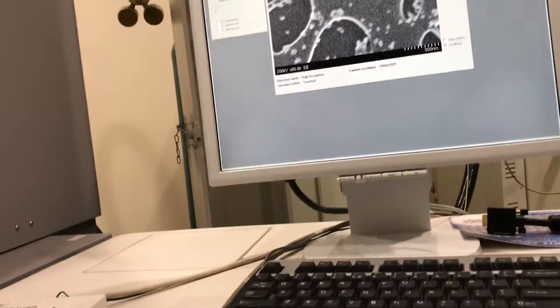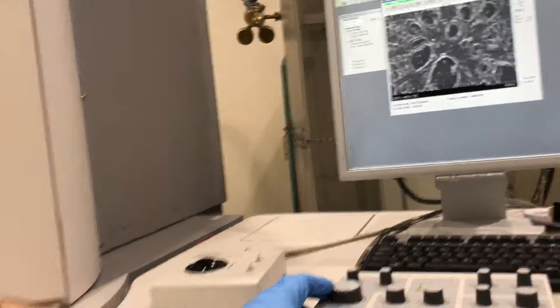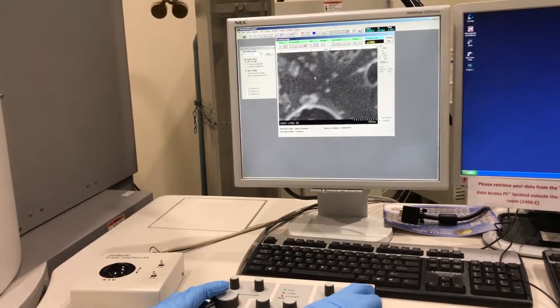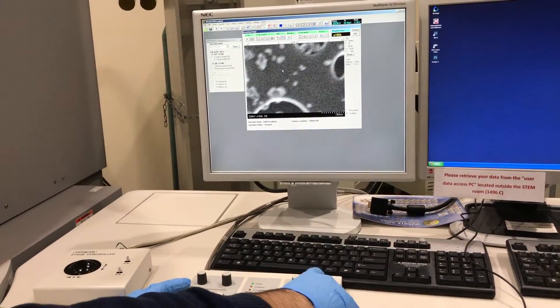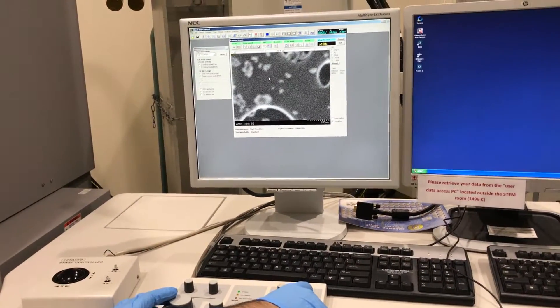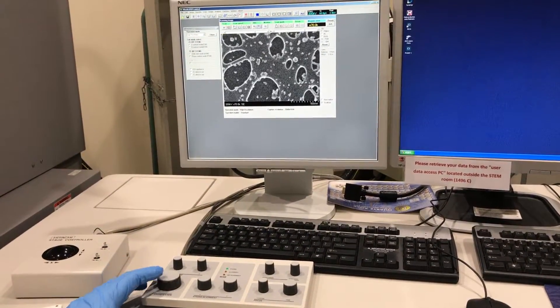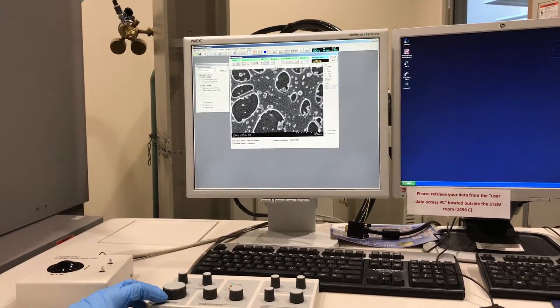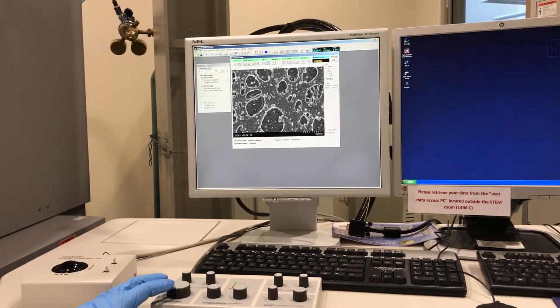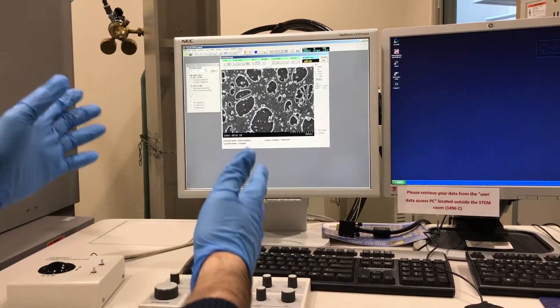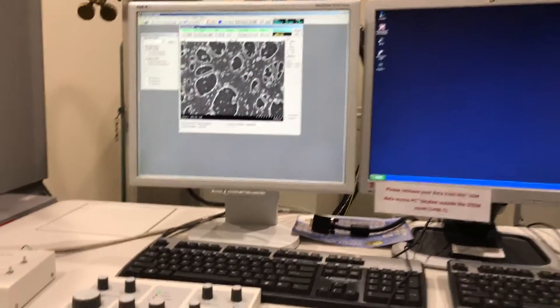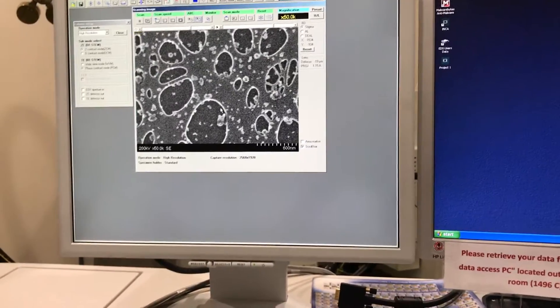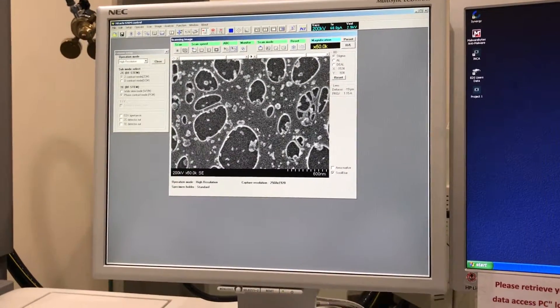Using the knob here and increasing my magnification, I can use my focus knob to focus better on the sample. Now we can start to calibrate and align the microscope. To do so, it's better to start around 50K. Find a location that has features on it. Usually you start with the STEM mode — right now we are on STEM mode — and find a location with enough features for the software to calibrate and align the microscope.